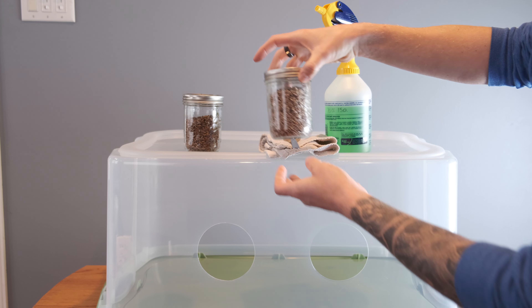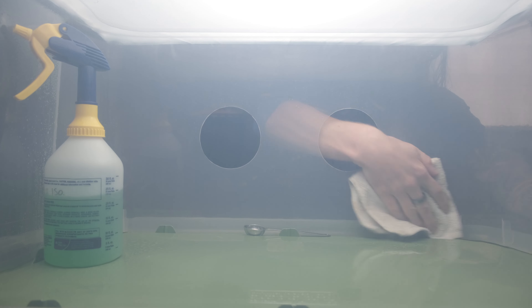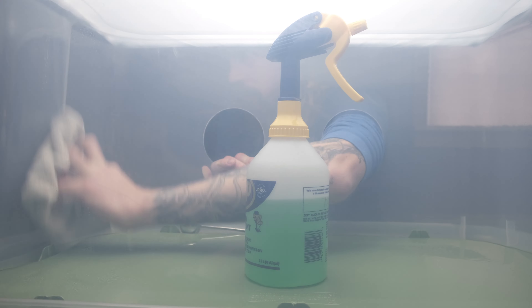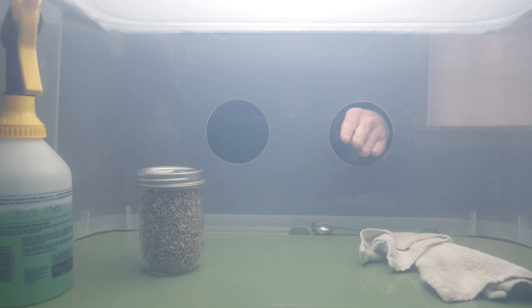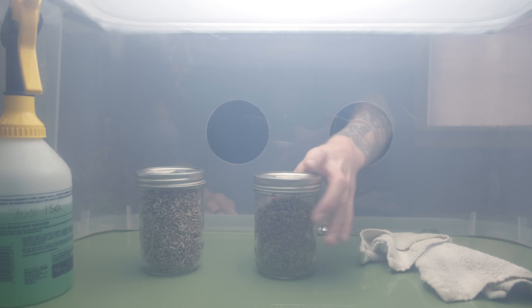Start by breaking up the colonized grain and make sure there are no big clumps in it. I then move my spray bottle and wipe into the still air box and give everything a really good spray down. After I've sprayed it, I wipe it all down until it's dry, and then I move the grain into the still air box.